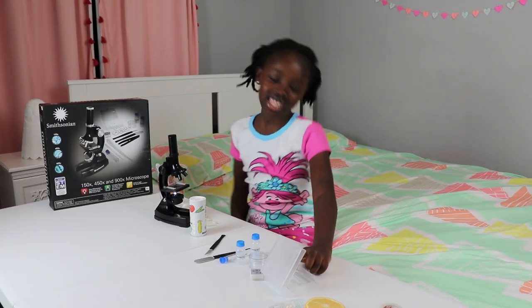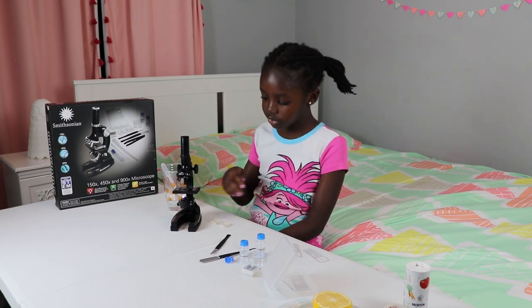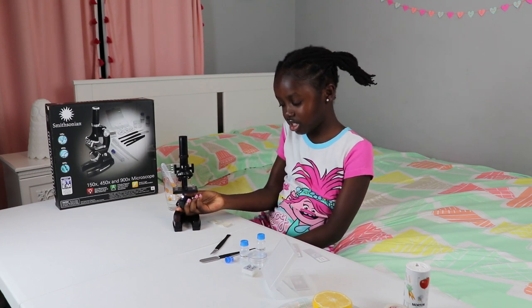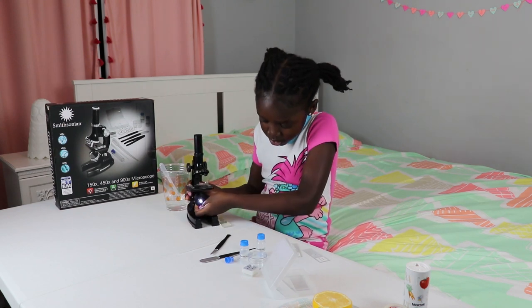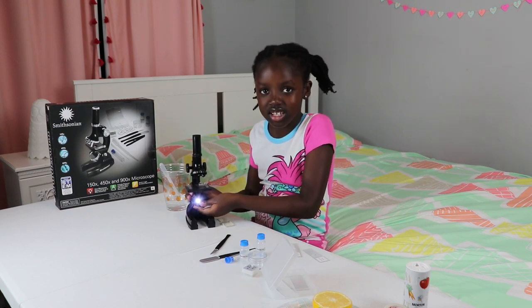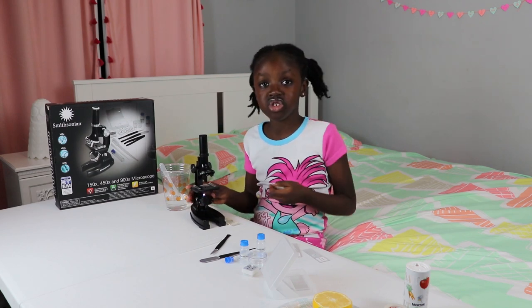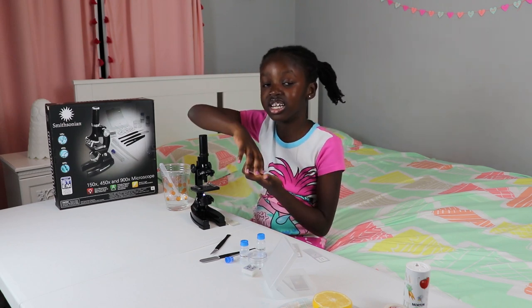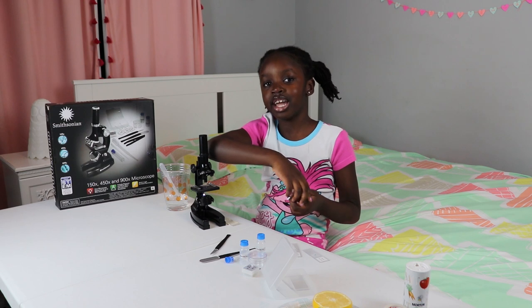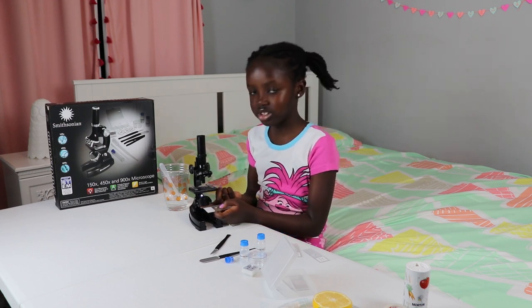So now let's get started. If you want this light to work, you need to insert AA batteries so this light works. You need that to see clearly because when you zoom in all the way, the light gets darker. So that's why you need the light under it so then you can see it.